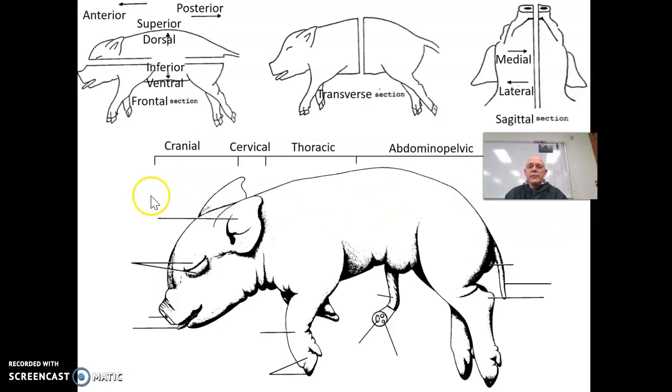All right, now to name some actual things on the pig. First one we have is, I believe, start at the ear. Okay, so the external pinnae. External pinnae is this little flap out here. Not all animals have it. Moles, for example, live underground, and gophers and things like that very often don't have an external pinnae. Even snakes and things like that have a little ear hole on the side of their head, but not a flap. And lizards, there's a lizard, Chad, in the other room there, they have a little hole in the side of their head, but they don't have any ear flap sticking out.